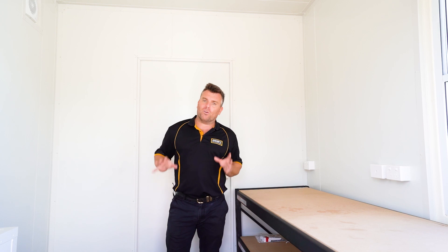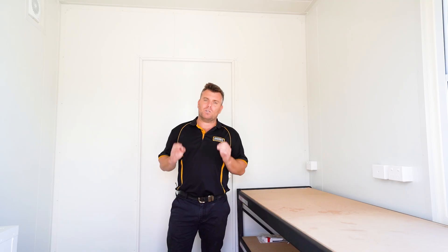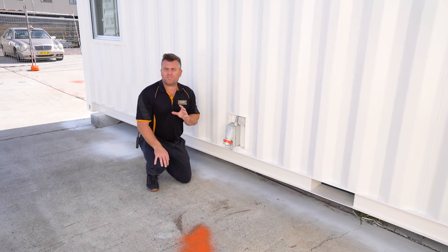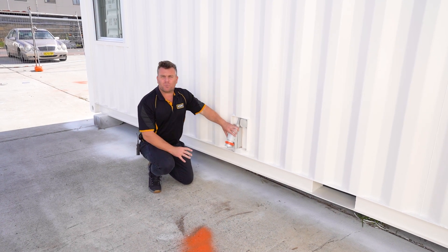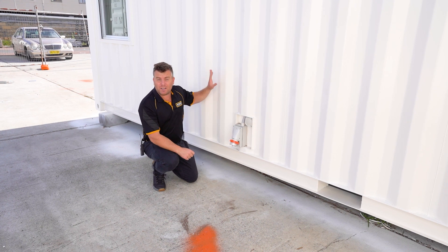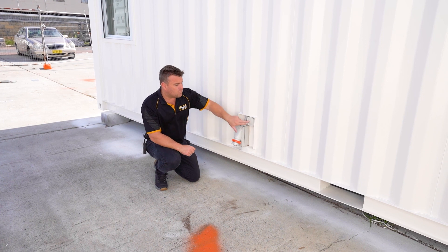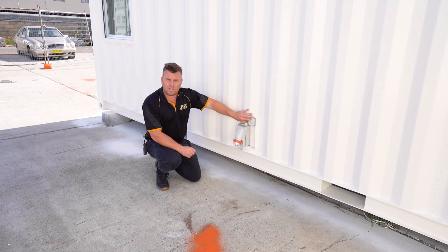On the floor we had to be robust, and we've gone with our commercial grade vinyl flooring, coved up the walls to ensure it's super easy to clean up when we're done. Now one last feature on the outside: we needed to power this one with a three-phase inlet, so the client has the ability to power it up with a generator on site. They're going to be running some pretty serious equipment in that analyzer section, so three phase was needed. We've got a little IP56-rated junction box and this is where our data is going to be coming into.